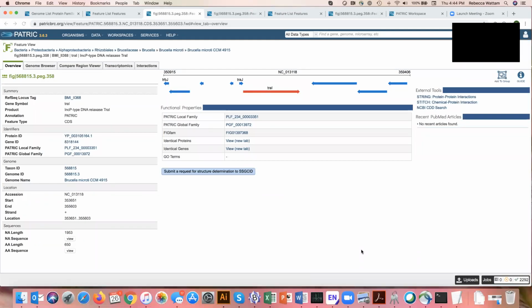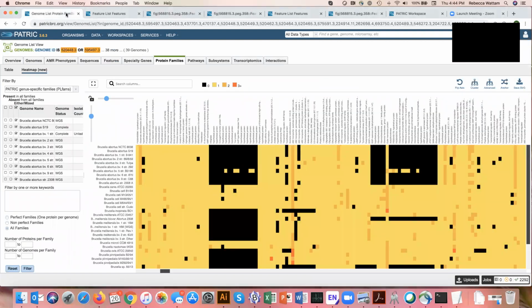Hi, everyone. As part of this comparative genomics section, we're going to talk about taking a genomic region and BLASTing that and how you confirm things. So let's just give you the setup here.